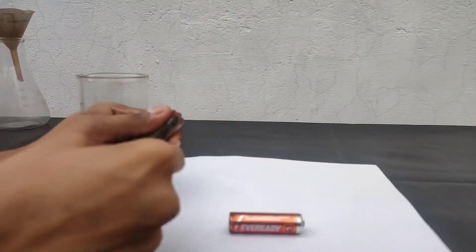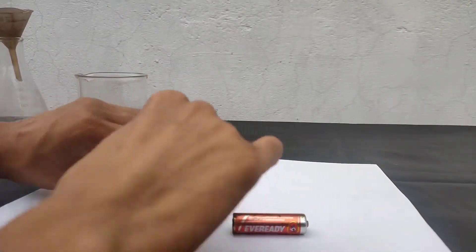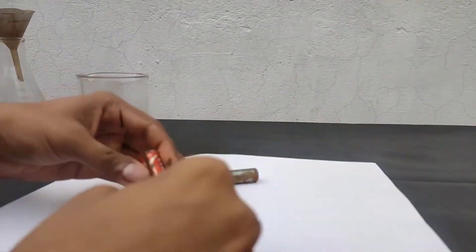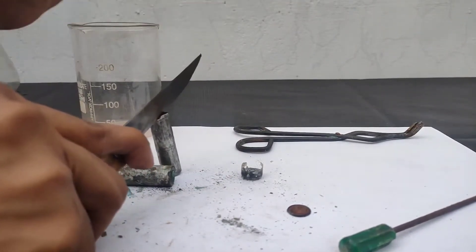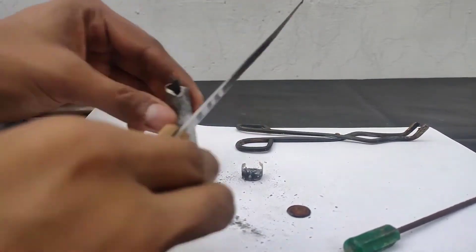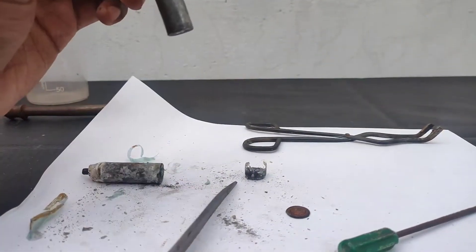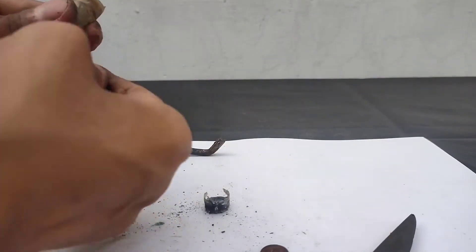First I will open the outer casing with a screwdriver, and then I will take out the lamination inside. After removing the lamination, I will take a knife and a hammer and make a cut in the zinc case of the dry cell. Then I will peel it off like the peel of a fruit — this was oddly satisfying.